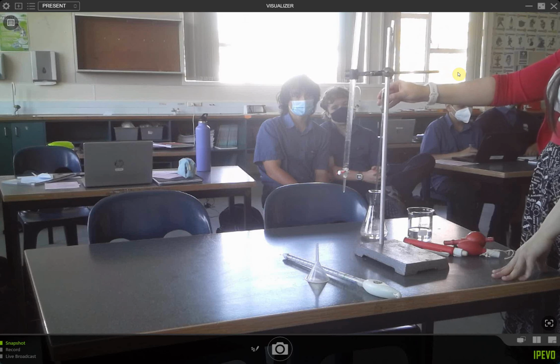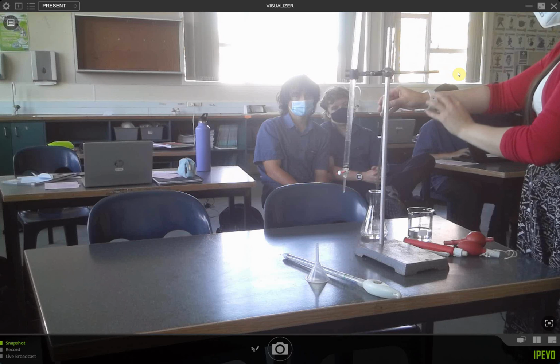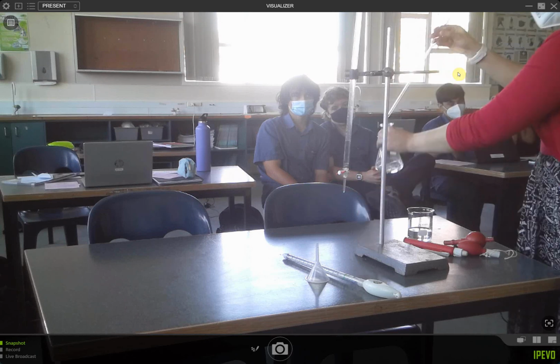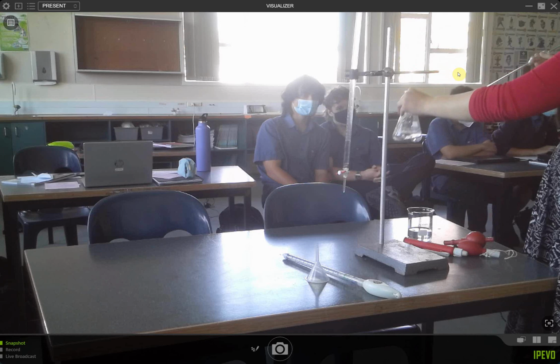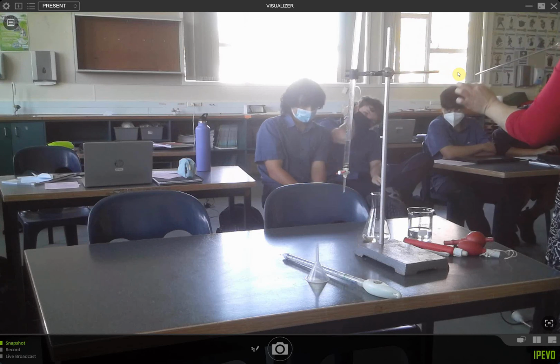Alright, now it's nearing the end and not everything is going to come out, and it is designed to factor that error in. What you do want to do is touch the tip of the pipette against the flask so the water tension pulls out, and that way you get the accurate value. But there's going to be a little bit left over, and that's okay. It's designed to have that error in there.